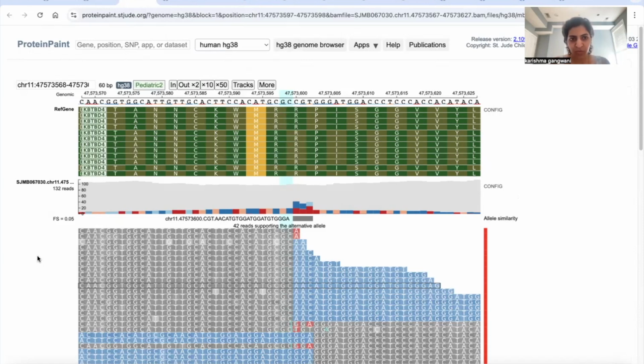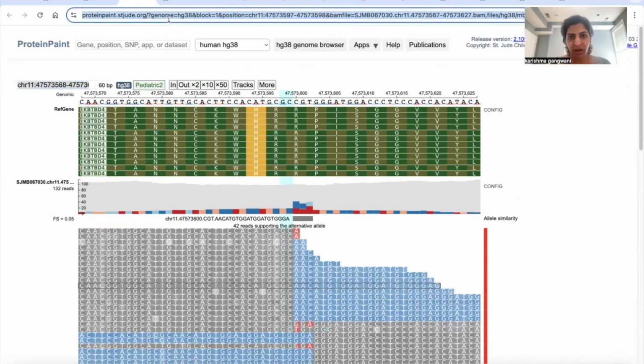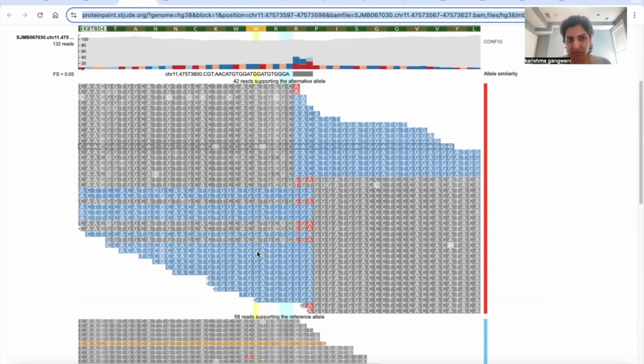And so how we have used this is you have your reference genome, and I have just zoomed into the region where this particular conserved repeat in the Kelch2 domain is present. And there are certain parameters that you have to use. Now, these are BAM files directly obtained from the raw sequencing data. And what I've done is I've just positioned or aligned the sequence of these BAM files in accordance with the reference genome. And that's how I was able to look at some of these mutations.